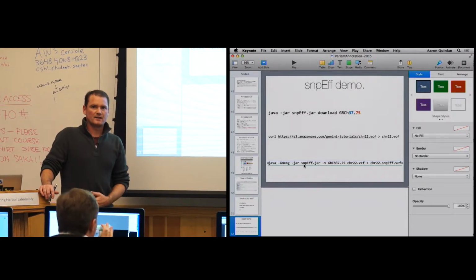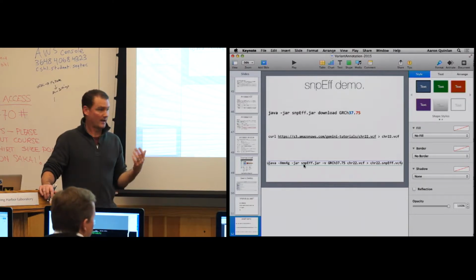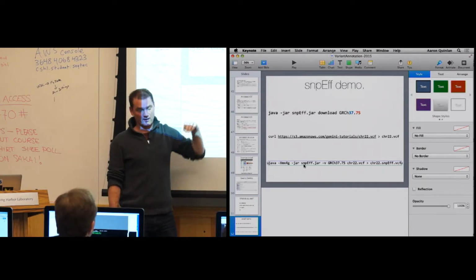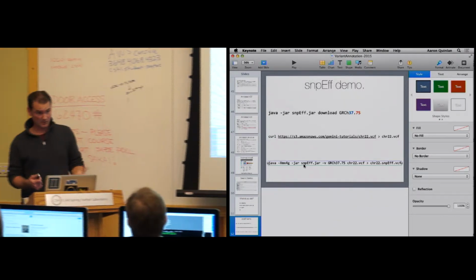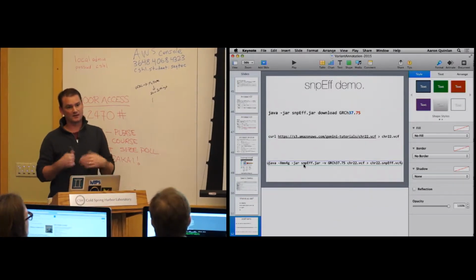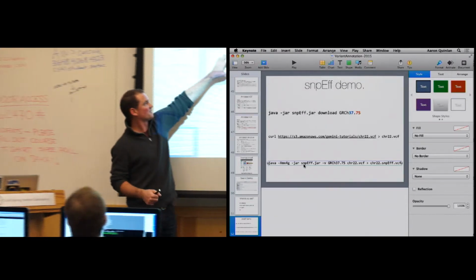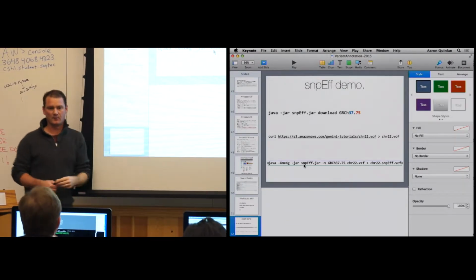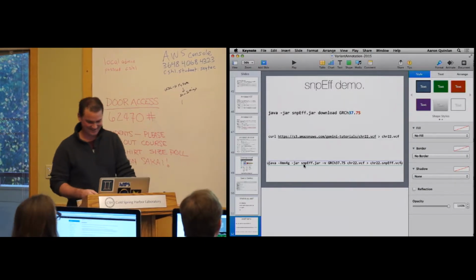Tools such as GATK and Picard, which I think you probably talked about, are also written in Java. And one of the most common errors that you get when running those programs is that you just didn't give them enough memory. You'll get an error, and then you go in and change this variable to give it 4 or 8 or 16, depending on how much memory you have, until it stops giving you errors, essentially.